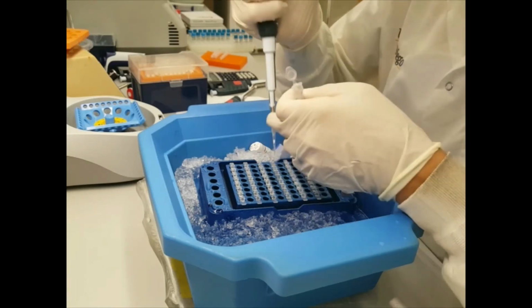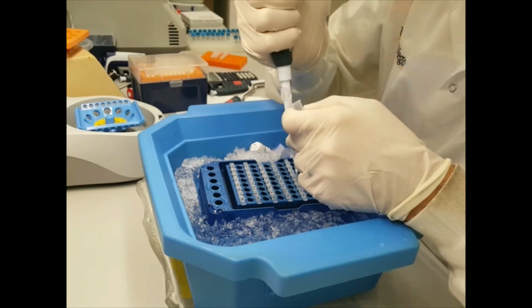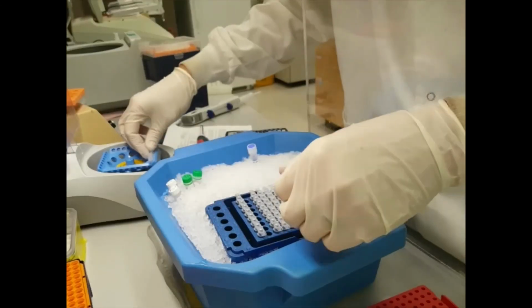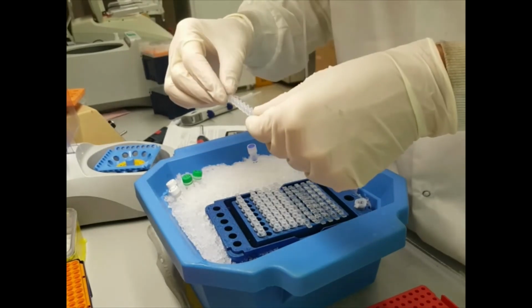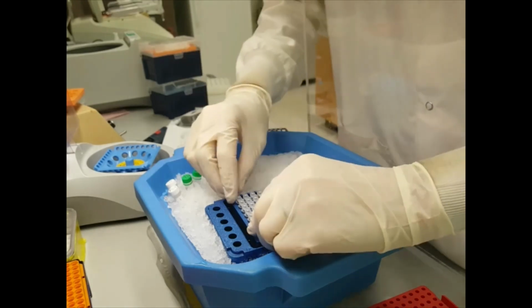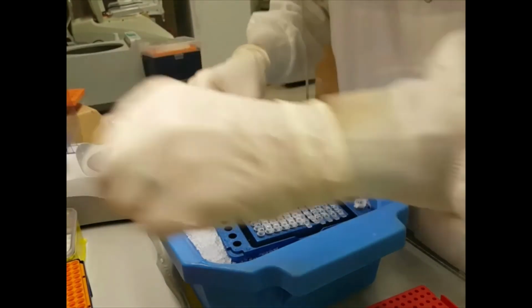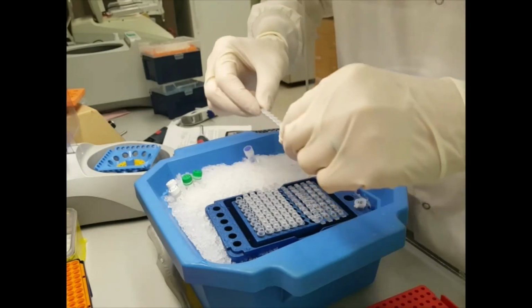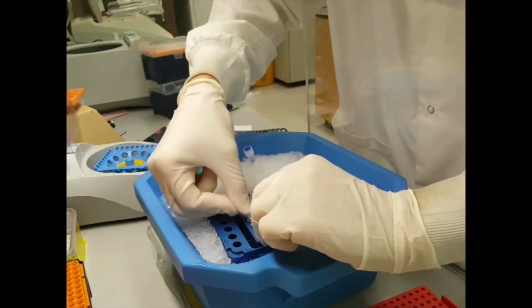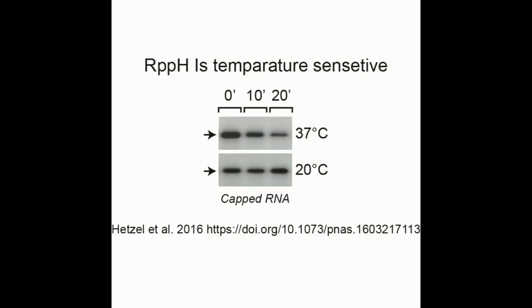Again, after mixing everything nicely, pipette 4 microliters for the csRNA-seq and 2 microliters for the inputs into the lids of PCR strip tubes. Once the RPPH mediated decapping reaction is done, you can now quickly exchange the lids and incubate the samples at 22 degrees for an hour to 2. Note that the RPPH enzyme would also remove the adenyl group from the 3' adapter. However, it is inactive at 22 degrees.